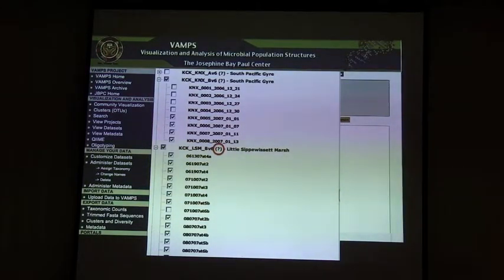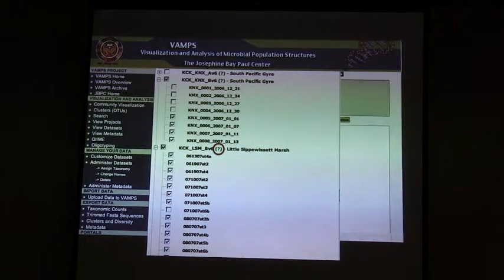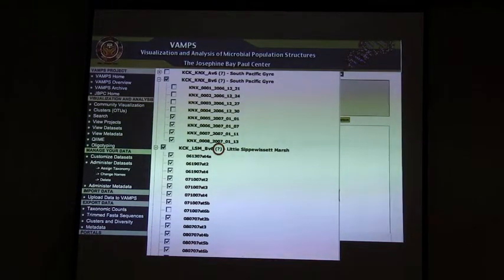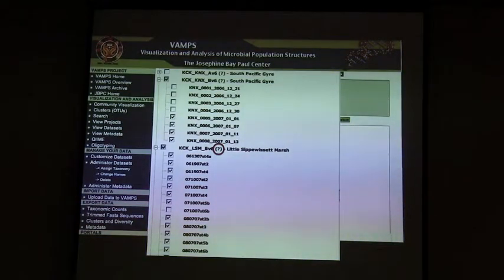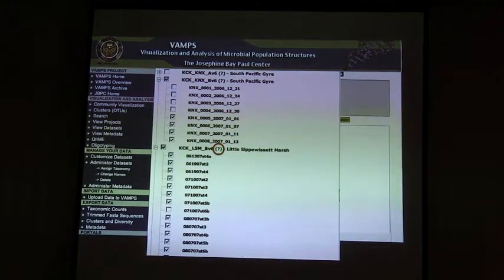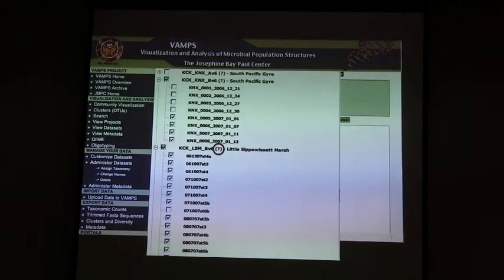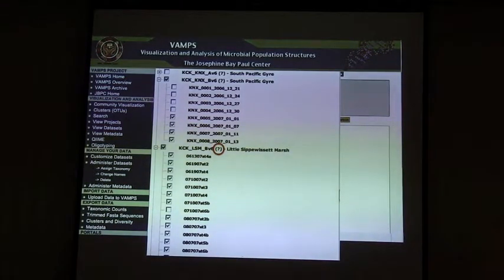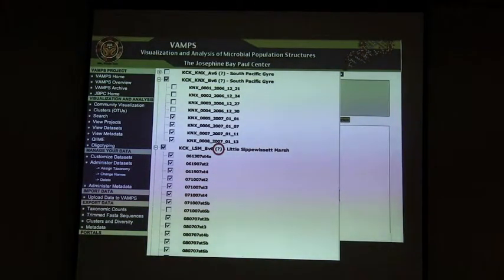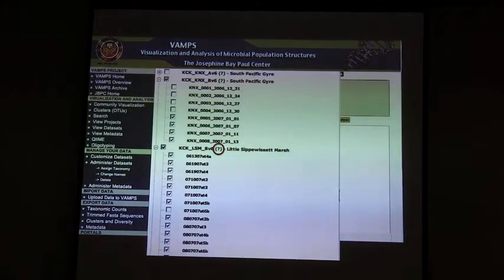One of the things that we have tried to do as best we can is to collect metadata. We actually have very rich metadata sets from the International Census of Marine Life Initiative. And if I understand correctly, I think we've turned off the entry of metadata into VAMPS right now. Is that correct? And the reason for that is that we're now forming this coalition with QIIME, and QIIME is going to take in metadata for us. And they have all these undergraduates under Gail's charge who go through and make sure the metadata is correct.